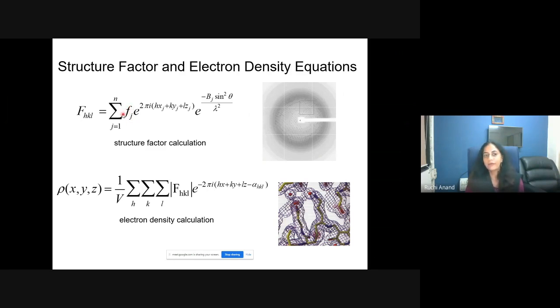And you can see here Bragg's plane also comes in, because you remember Bragg's law is used a lot in crystallography. And then there is something called the temperature factor, which tells you how much the molecules are moving in the crystal. Because many times if a region is flexible, then the motion is more and the B factor will be high. And it's a function of resolution here.